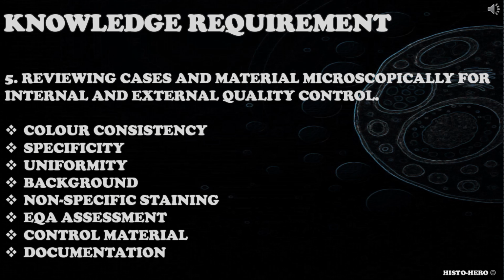Consider color balance and consistency, specificity of staining, uniformity of staining, presence of background staining, contamination or deposits, presence of nonspecific staining, UK NEQAS assessment criteria, control material used, documentation.